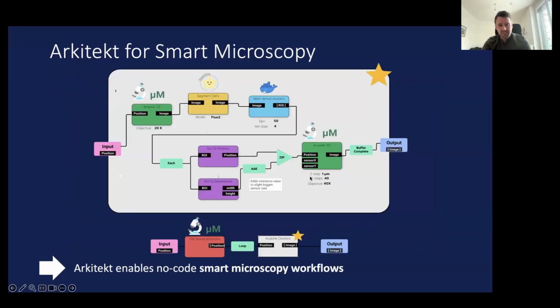And yeah, the whole idea is, again, this thing is just a drag and drop workflow. So once these nodes exist, you can just wire them together in a workflow. There is this caveat that you need to write this node, right? You need to know what the microscope can do, and you always have to have this plugin first. And they need to be sort of translatable to other workflows.